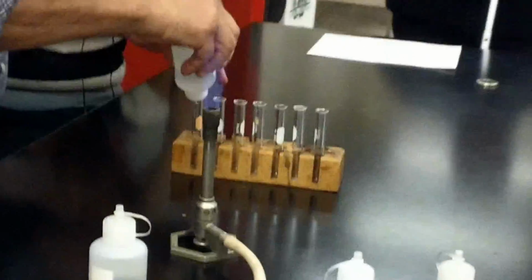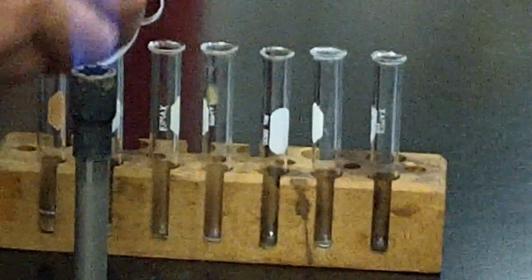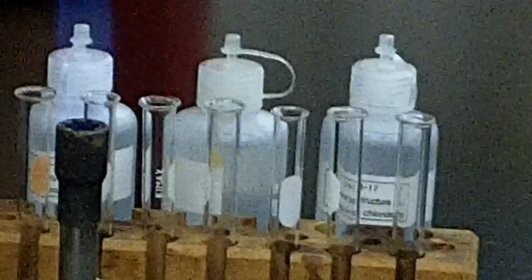This is sodium, and I want to be able to just show you how this works. So you're going to be doing these tests yourself. So the first one is sodium, the second one is calcium. And I'm just going to line these up in the order just so we don't get confused. This is now potassium in the third. And you don't need very much of this, you just need a bit down at the bottom of the test tube. This is barium. Now, copper, if you look at copper, it's blue to begin with, so we don't need a whole lot.